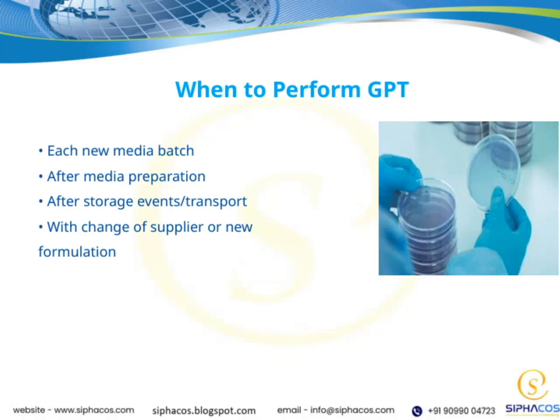Let's talk about the best times to perform GPT testing. First, it's important to do this with each new media batch. This ensures that every batch meets our quality standards before moving forward. Next, we should perform GPT after the media has been prepared. This helps us verify that the preparation process hasn't introduced any issues.